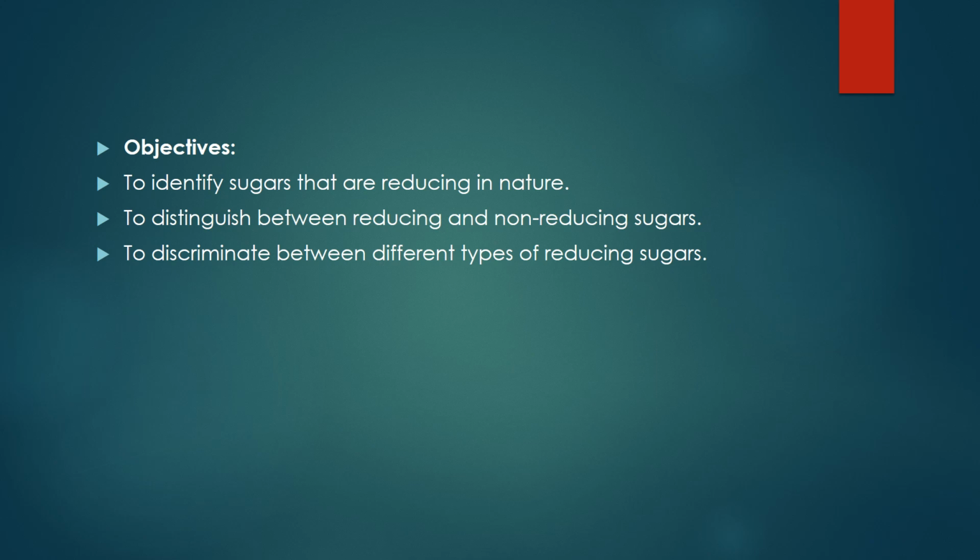The final result of the test will be the formation of osazone crystals.